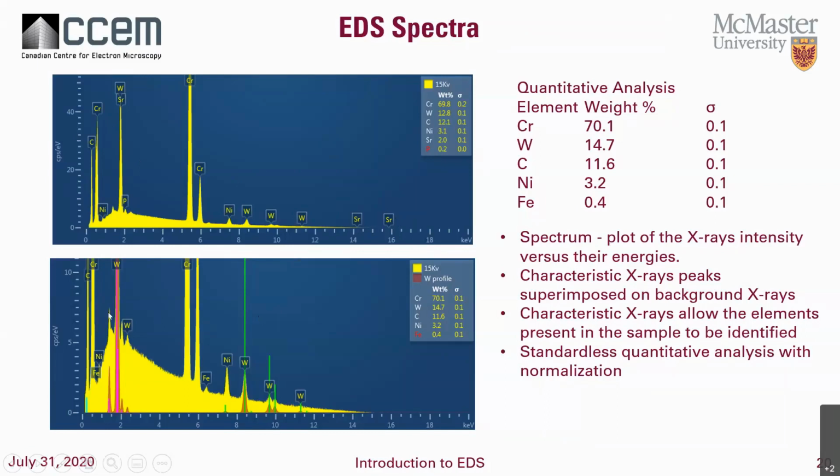Now, sometimes you will run into the problem that due to the sizing of the spectrum, it doesn't label all the peaks, even though you've asked it to. That happens. So down here, we've properly labeled the peak and we've gotten rid of the strontium peak.